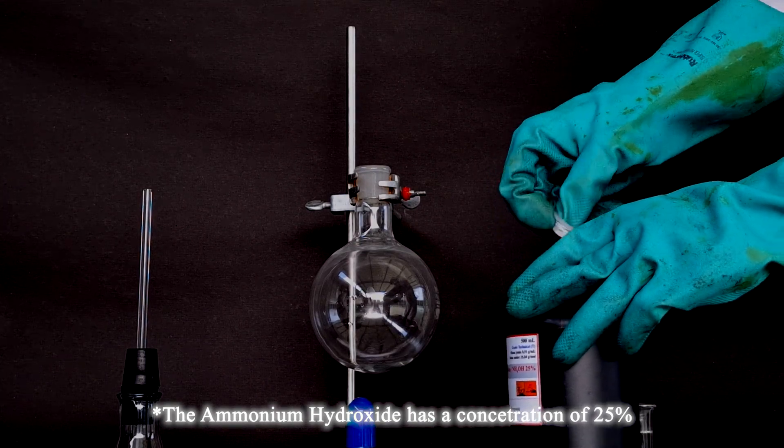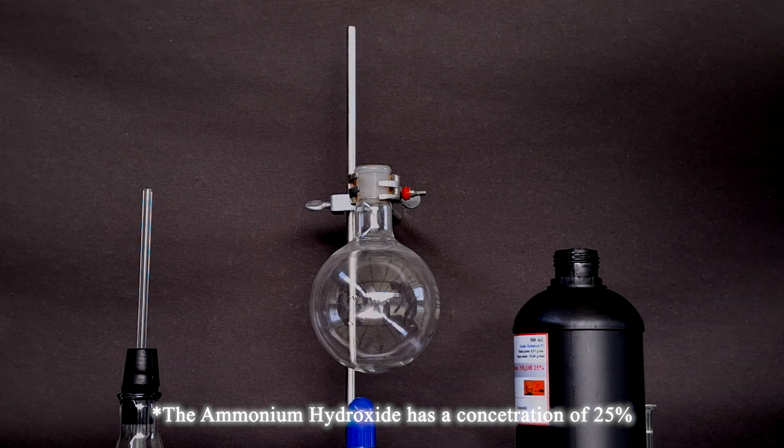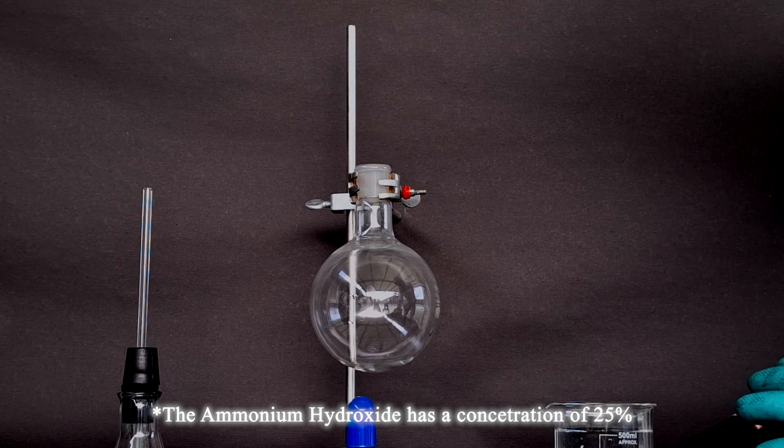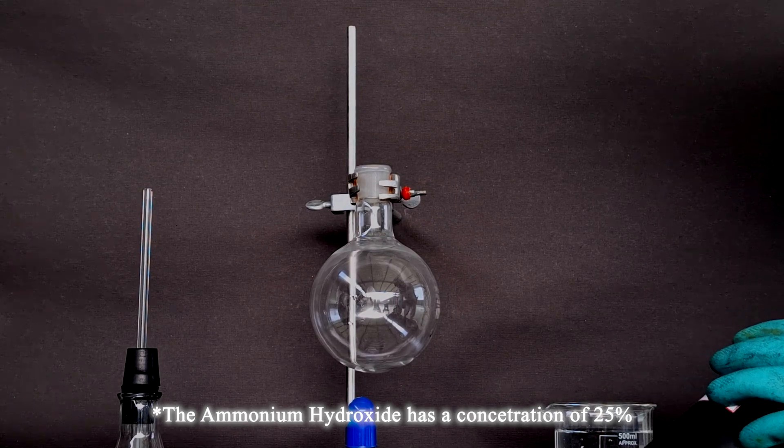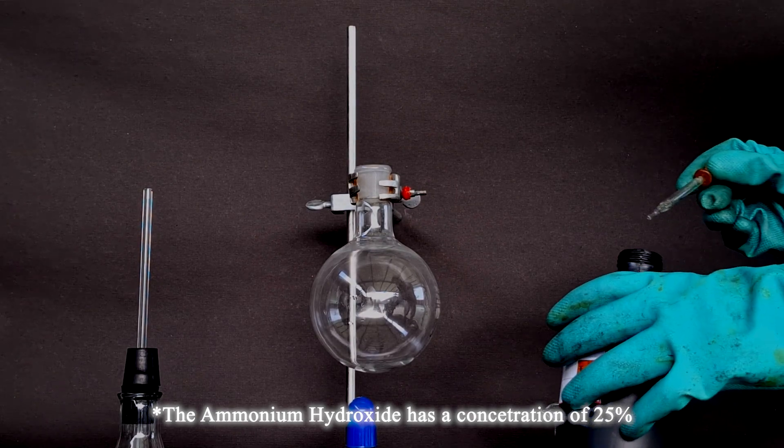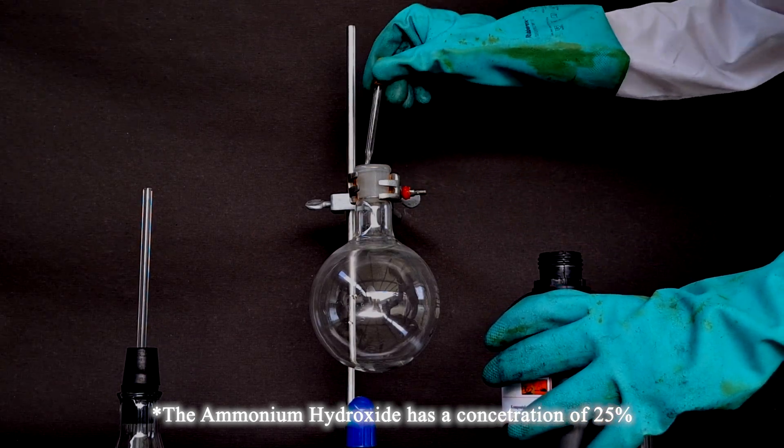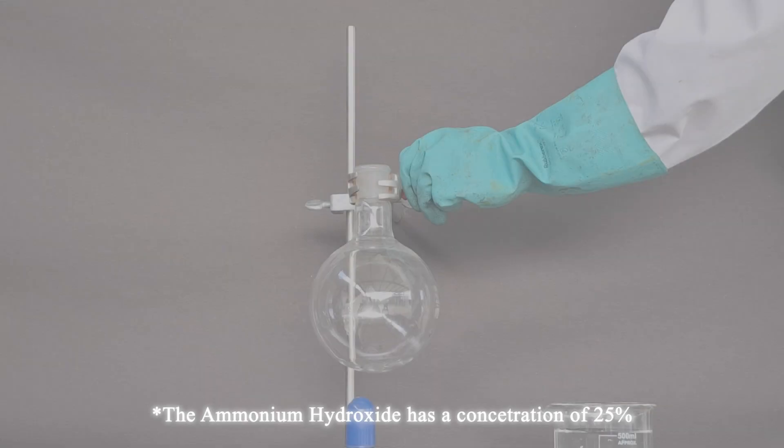After performing stoichiometric calculations, I determined that 6ml of ammonia should be introduced into the spherical boiling flask. It is vital to avoid adding an excessive amount, as this would result in excessive pressure accumulation within the flask, potentially leading to the explosion of the bung.